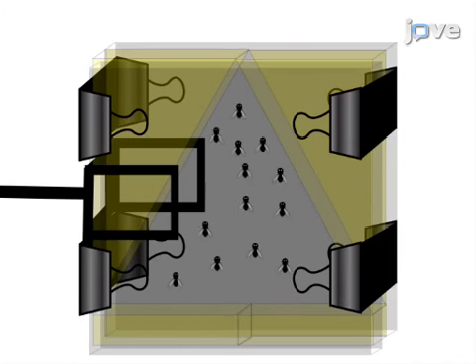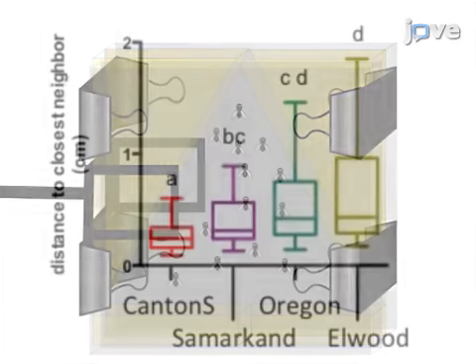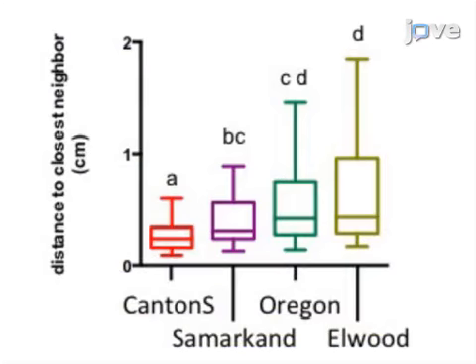Once the flies settle, their positions are documented, and the distances between the flies are calculated from this photograph by software. Ultimately, the social space assay quantifies a form of social behavior which can be used to study the influential environmental factors and neurogenetics of this behavior.